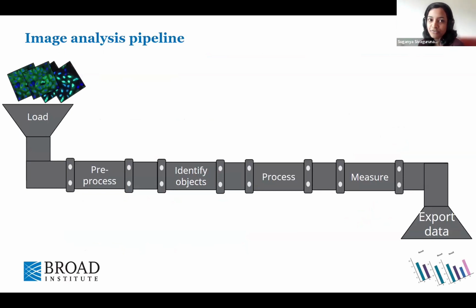The core idea of CellProfiler is building a pipeline. What do I mean by a pipeline here? We start adding a series of image analysis steps that need to be applied across images. And the good thing about CellProfiler is the whole series of steps that you build is applied exactly the same way across all your images. Hence, it is highly reproducible and there's no bias in analyzing your images.